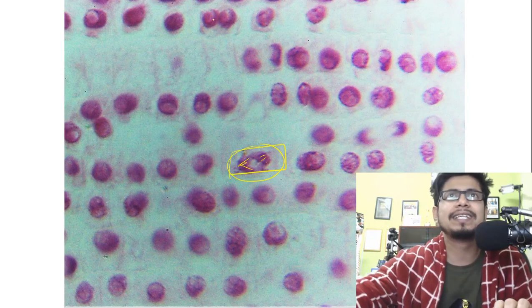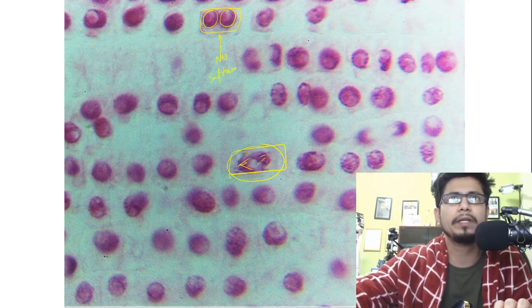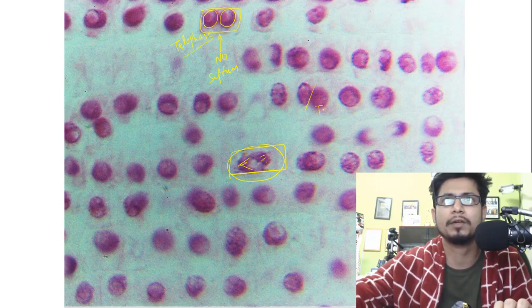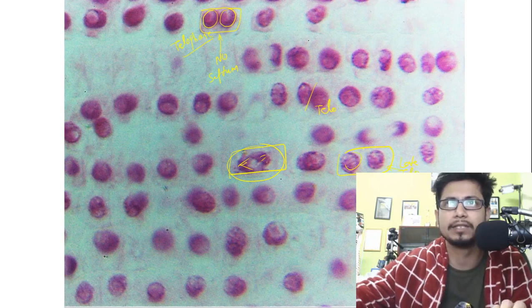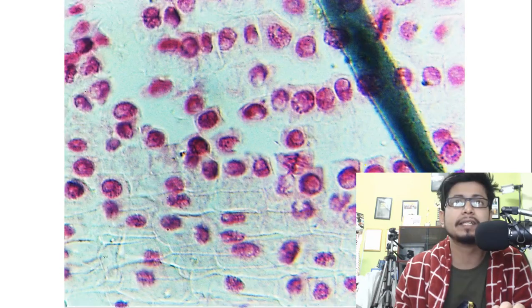This is the end of telophase. At the end of telophase, two separate discrete nuclei are formed but there is no septum formed between those nuclei yet. This is telophase of cell division. This is also late telophase, where you can see the nuclei are formed and they are being separated. Now the septum will form in the middle.